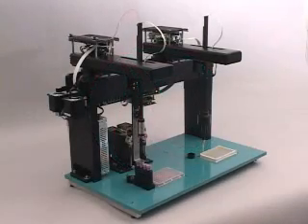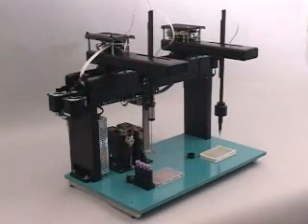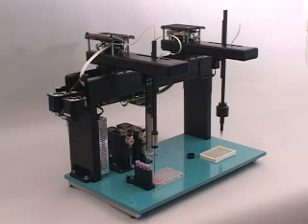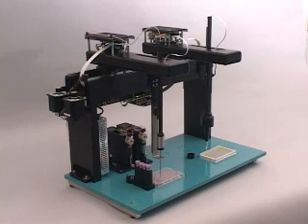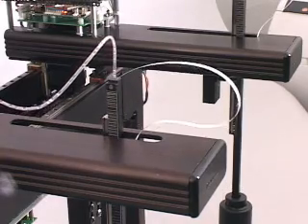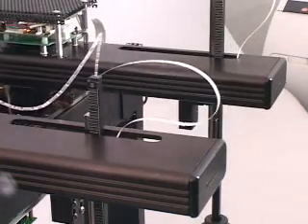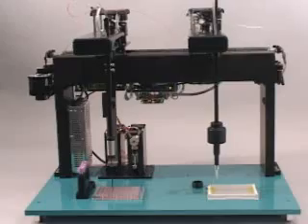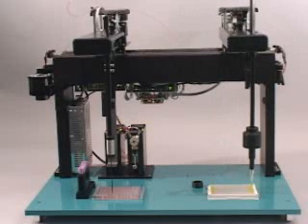The Triton Liquid Handling Robot is the quietest, smoothest, most reliable and economical OEM XYZ module available for automated instrumentation. Extensive life cycle tests show that XYZ reliability exceeds 5 million moves on the X and Y axis and 10 million moves on the Z axis.